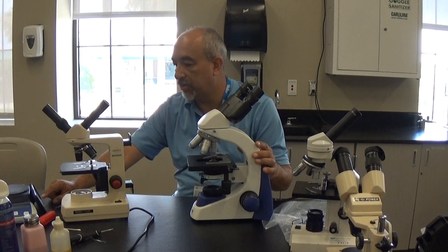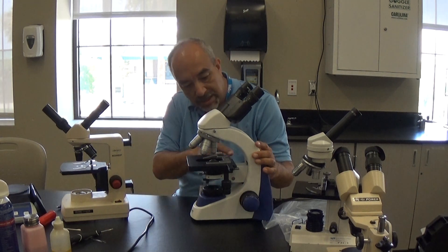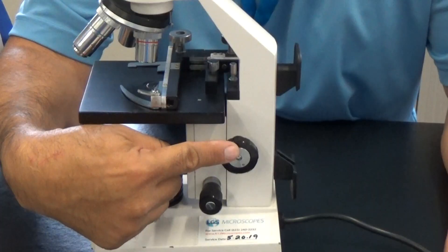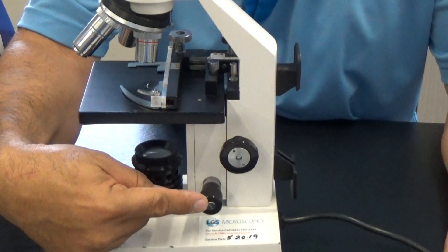Welcome to k12microscopes.com. Today we're on site at a local high school performing service on some microscopes and I thought I'd show you some of the items that we cover. Some of the things we're going to include are going to be to inspect and adjust the stage stop, which is going to be back in here. We're also going to inspect and adjust the coarse and fine focus assemblies.